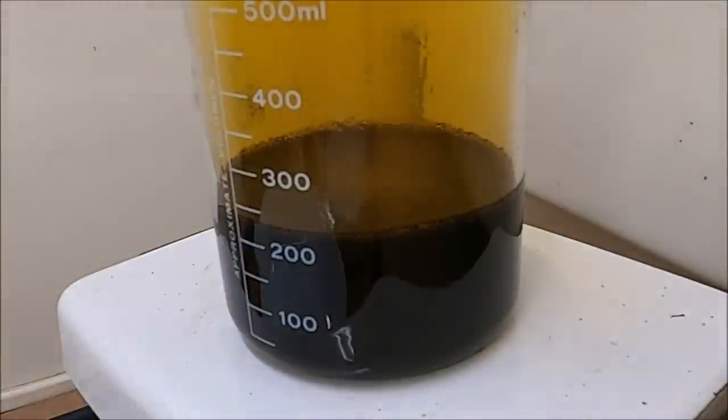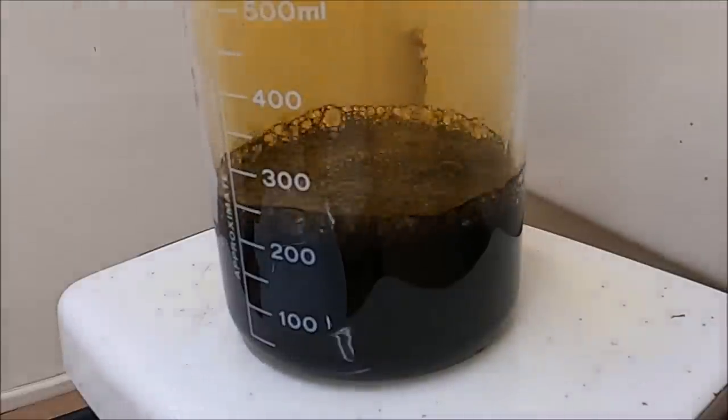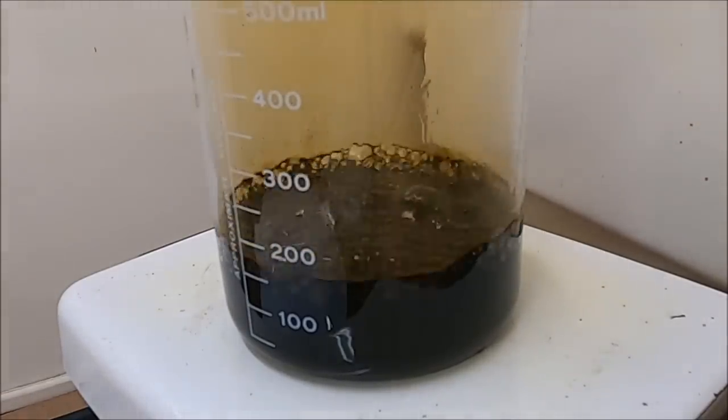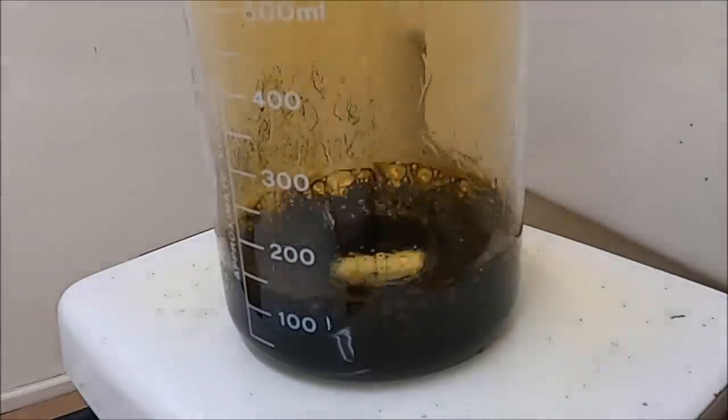So this is about an hour and a half time lapse. I cranked the heat up in an effort to go ahead and do the denox and evaporate it down to a syrup, and I left it on too long and almost evaporated it to dryness. It's coming up, watch right here.